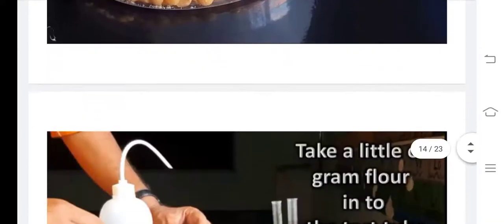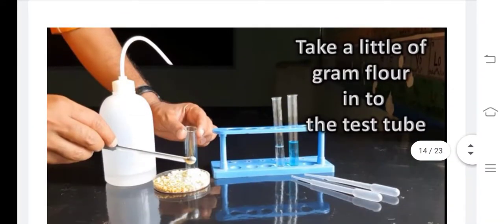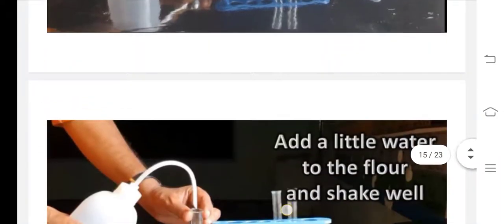Clear? Next one is, see how they are doing. What do we call this step? Procedure. What are they doing? Take a little gram flour into the test tube with the help of a spatula, where they are adding to the test tube. Observe this.